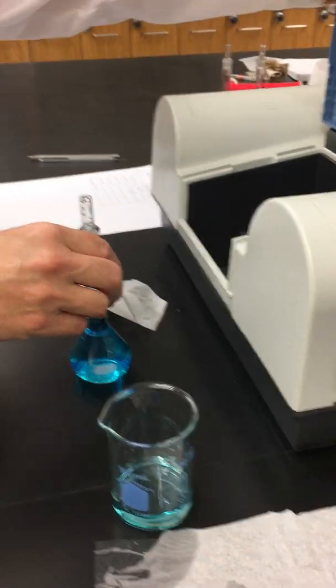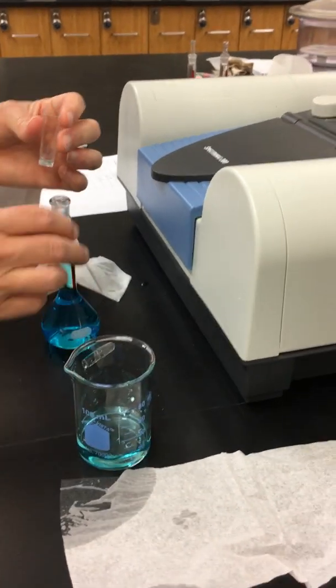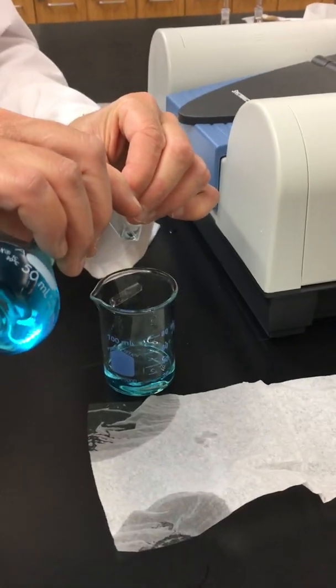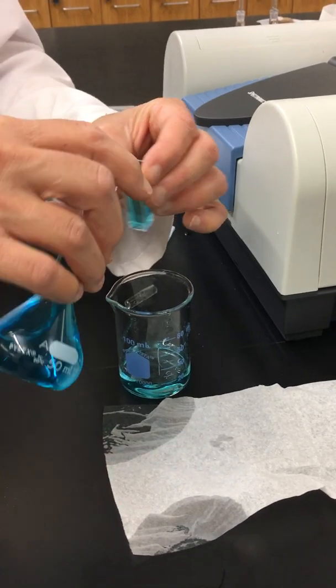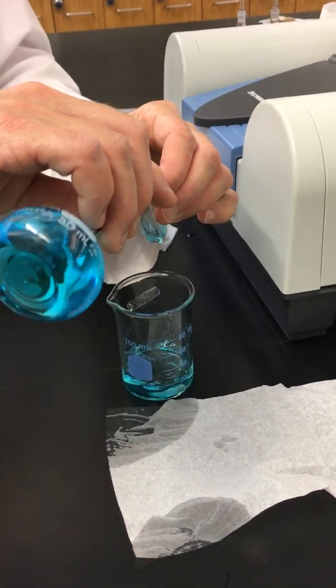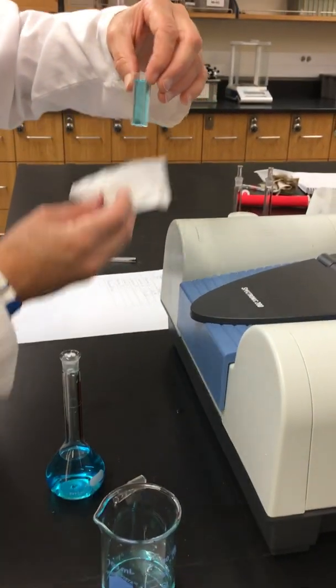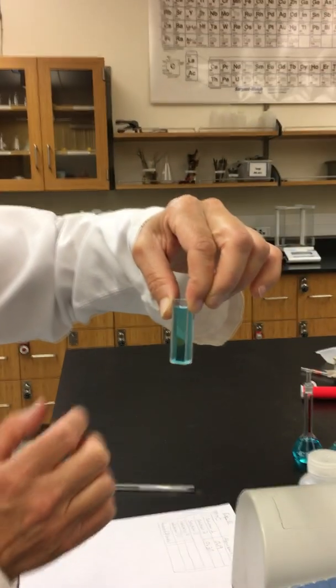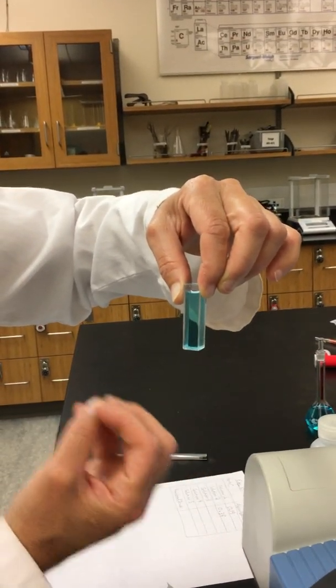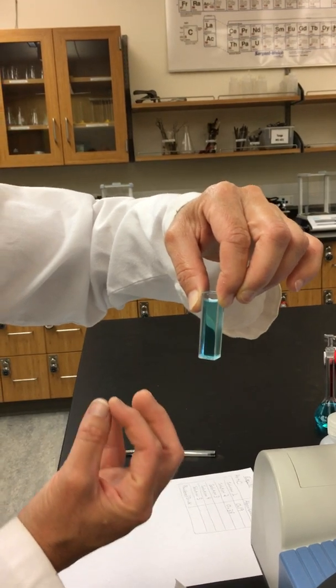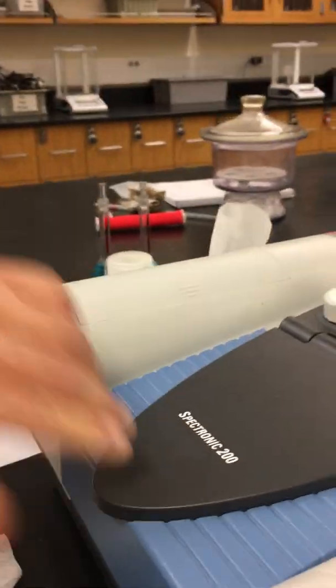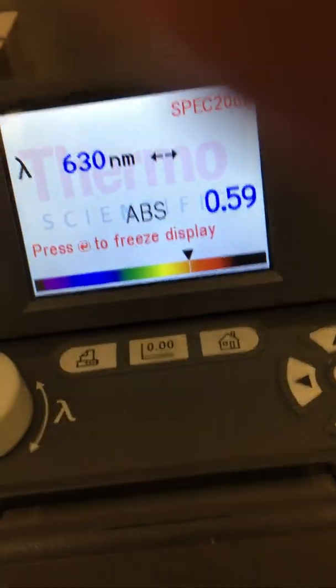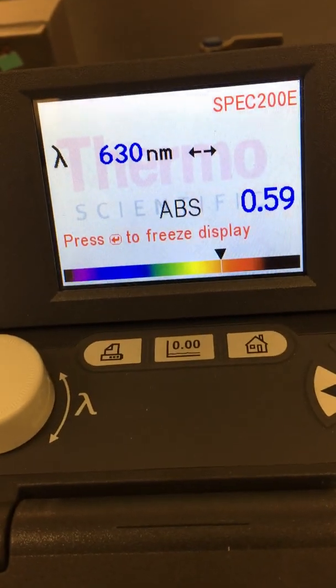We're done with solution two. We're now ready for solution three. My lovely assistant is passing my solutions to me. Same procedure, we're going to rinse it first. We'll wipe it off. Notice when I'm holding the cuvette, I'm trying to always make sure my hands are towards the top of the cuvette and I'm not grabbing it down low. This will help prevent getting any oil and stuff trapped on that cuvette that will throw off our readings. We'll place this in our spectrometer and we'll measure our absorbance of solution number three, which is 0.59.